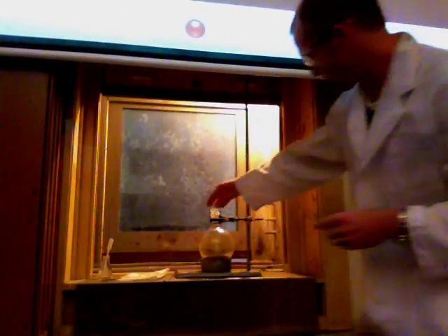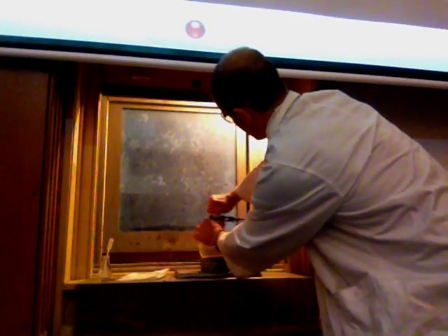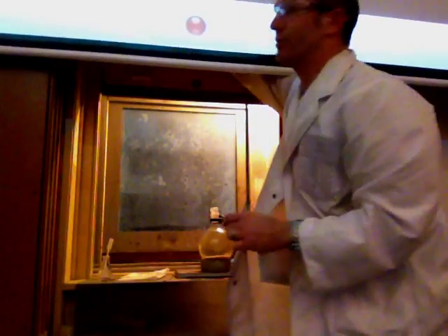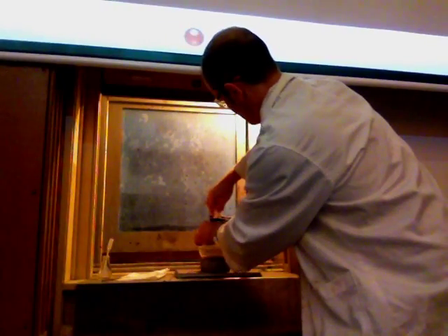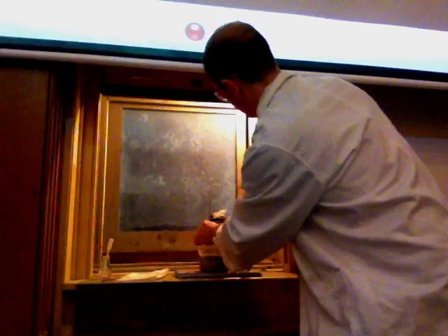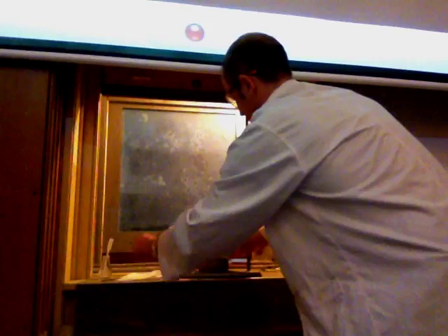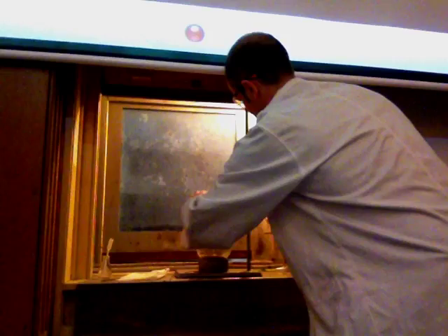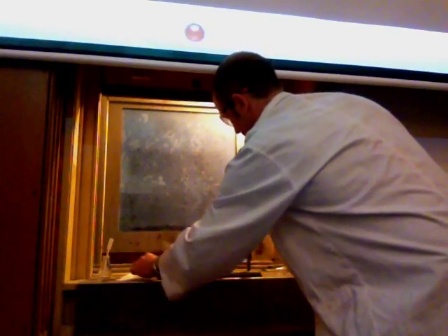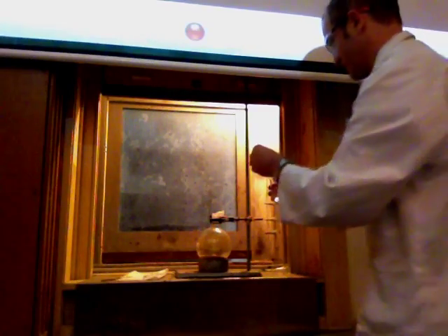I'm going to put the sodium into the chlorine. I'm going to remember to turn the fume cupboard on. I cut my sodium up into three pieces and I'm just going to put some water on top of it just to start it reacting.